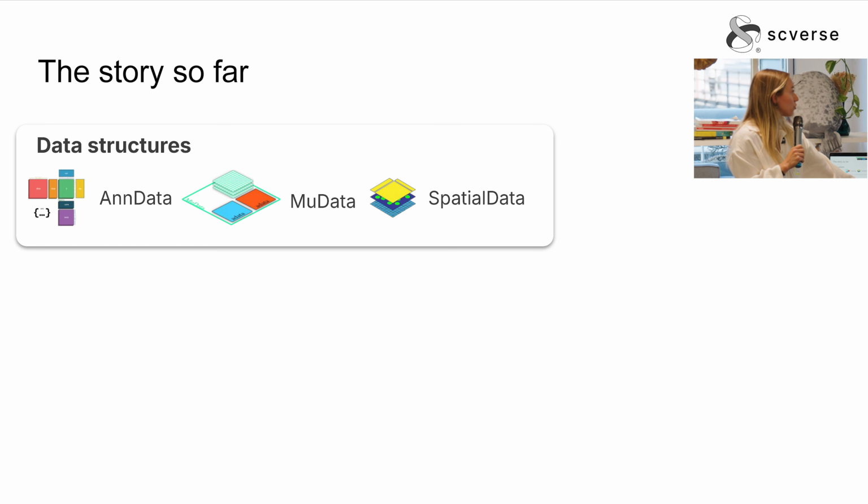So data structures, I introduced them. You're familiar with the space. AnnData, annotated data, is basically the main way to load your data in an object right now in Python. MuData is a dictionary of AnnDatas, so as many modalities as you like. They just share metadata, and they are basically structured and connected together. And SpatialData is kind of interesting because it has AnnData, the tables, the expression values are in an AnnData object, but you can also load all the pointers, like the raw images and everything. You can load it all in SpatialData, and they are layered and stacked, so you can analyze them together, and you can maintain all the information.